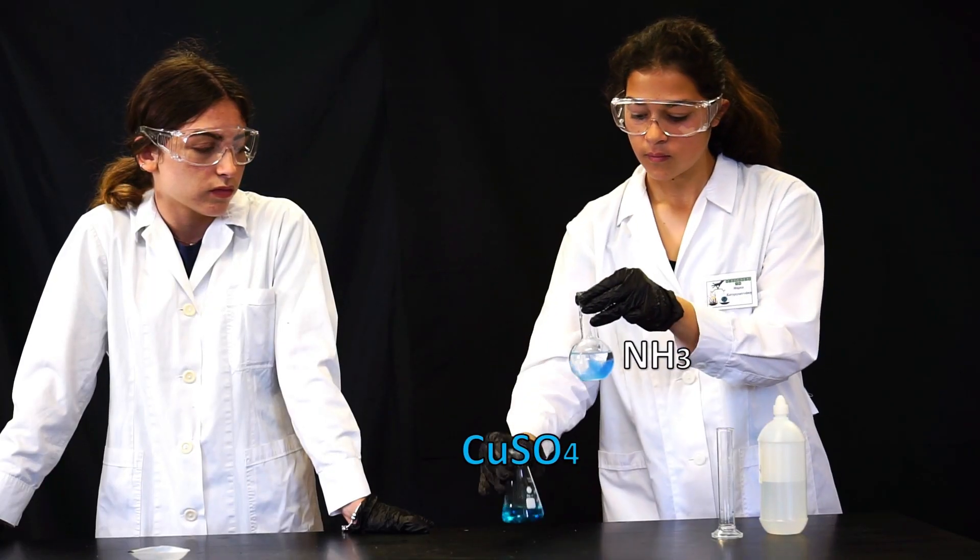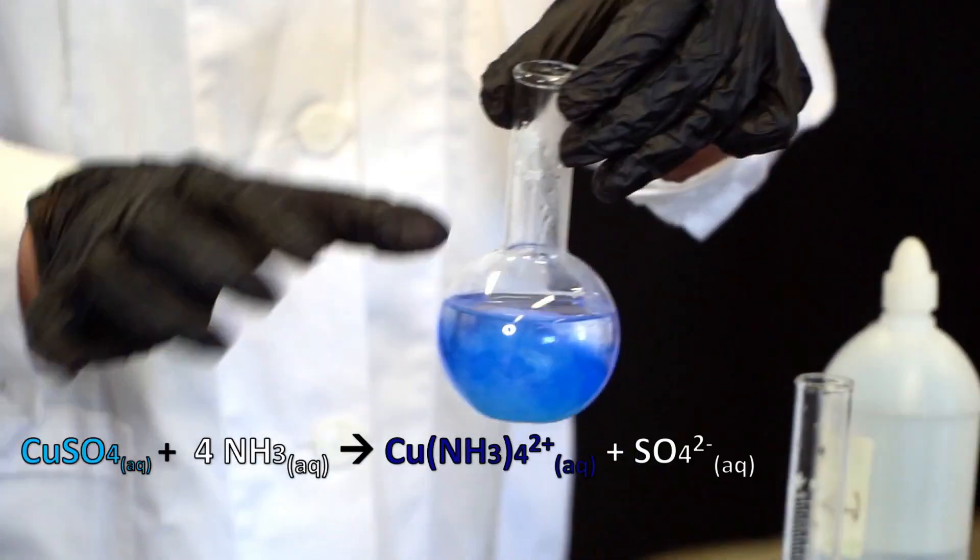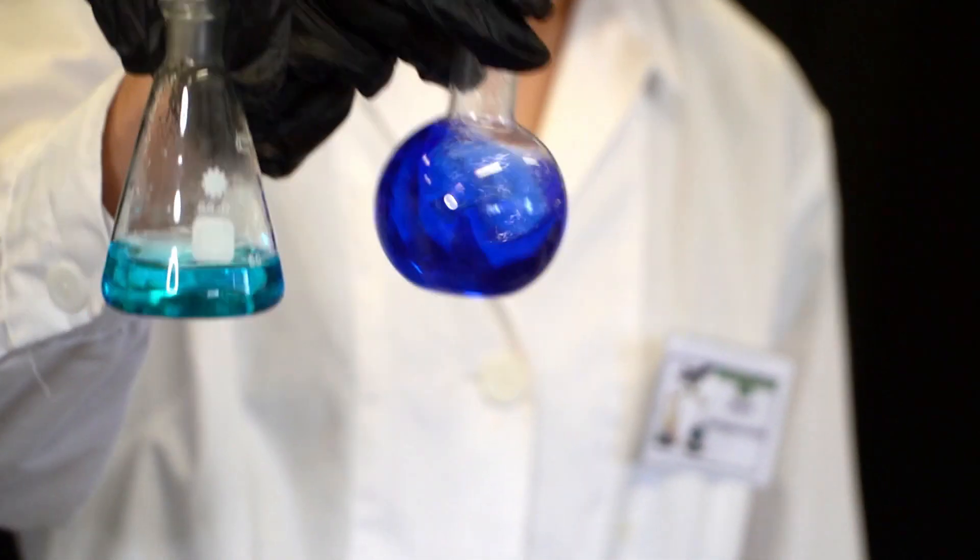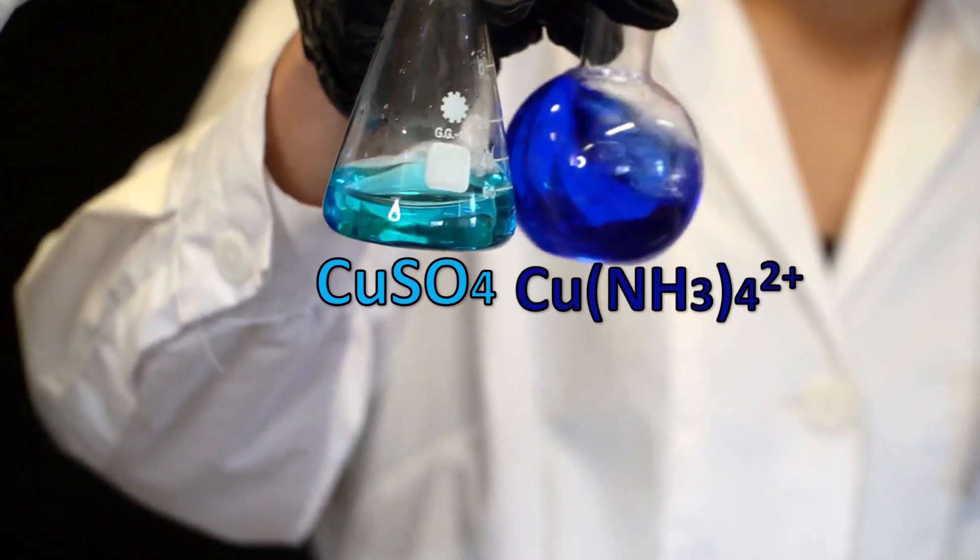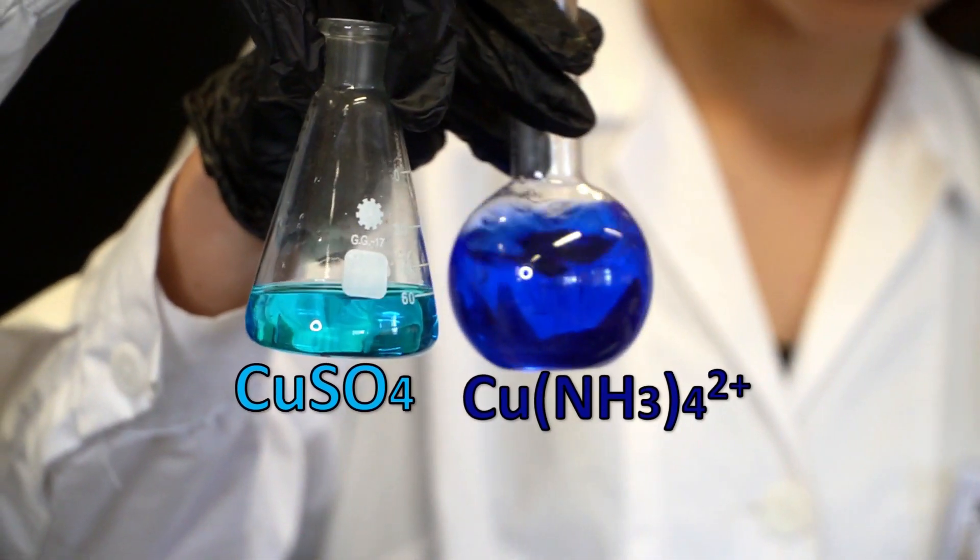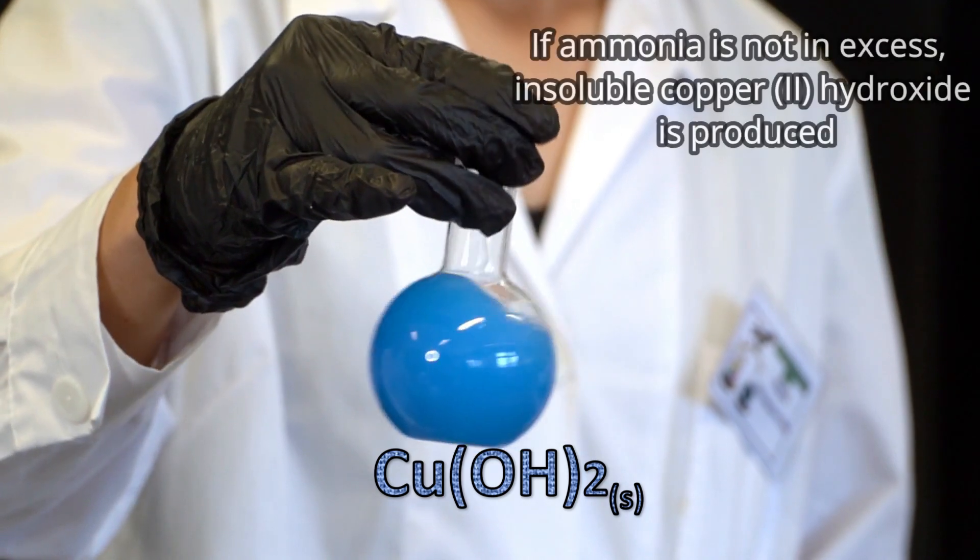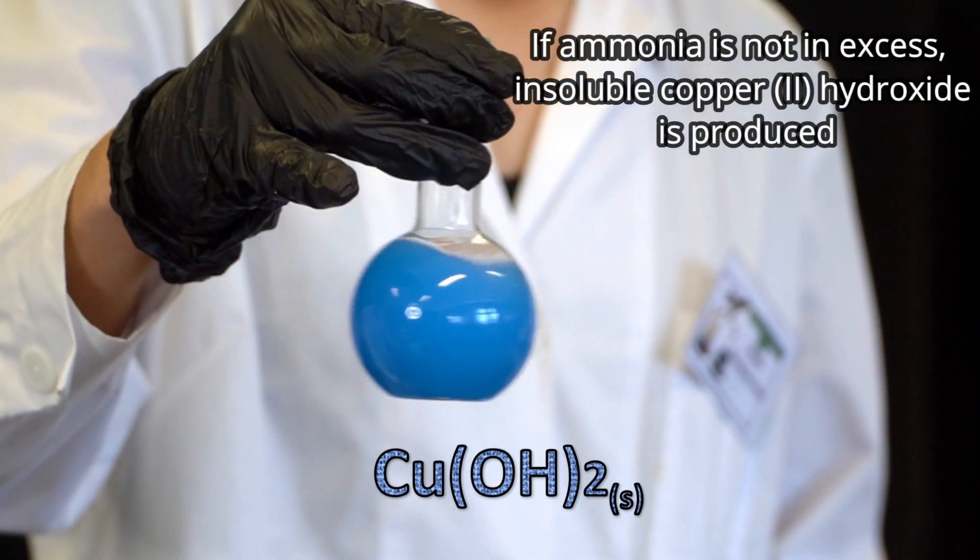When copper sulfate is added to an ammonia solution a bright blue complex of copper tetraamine is produced. However, if ammonia is not in excess a copper hydroxide precipitate is formed.